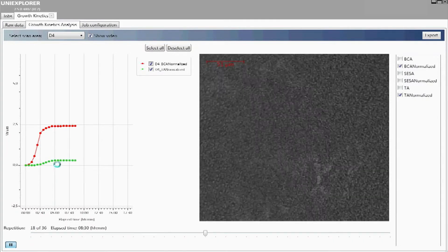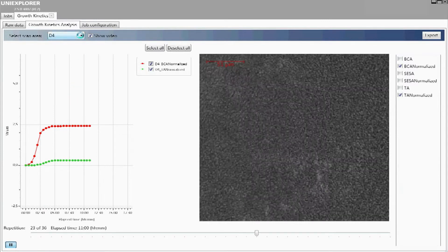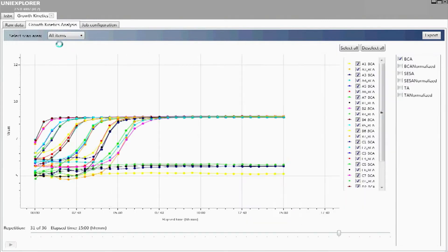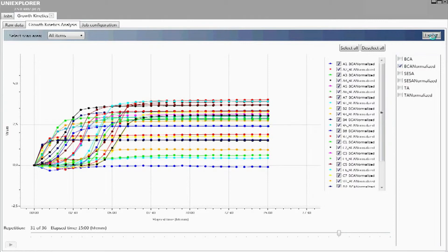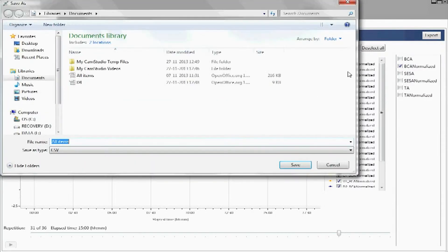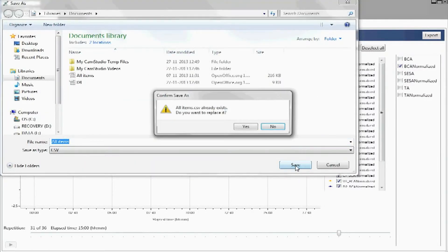When the measurements have finished, you can quickly see whether individual wells are anomalous using the overview facility. Data from growth curves from all wells can be exported, for example in the Excel format, and video films are saved in the standard AVI format.